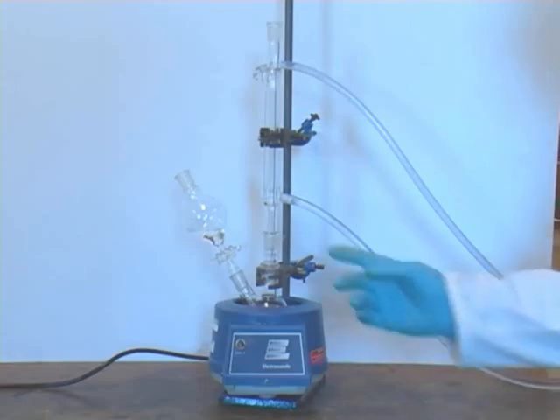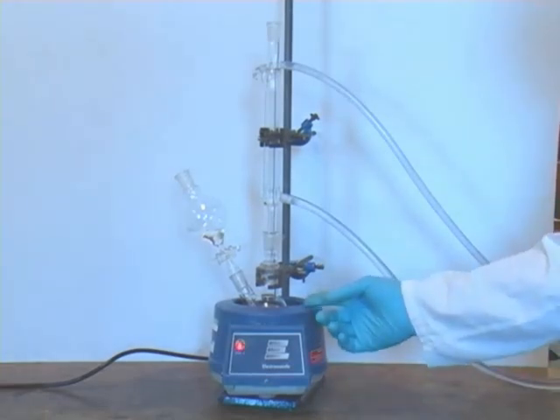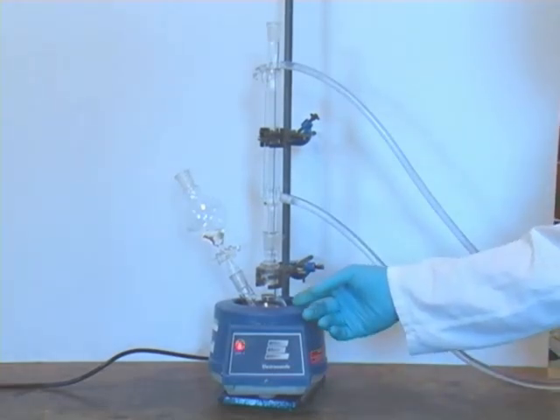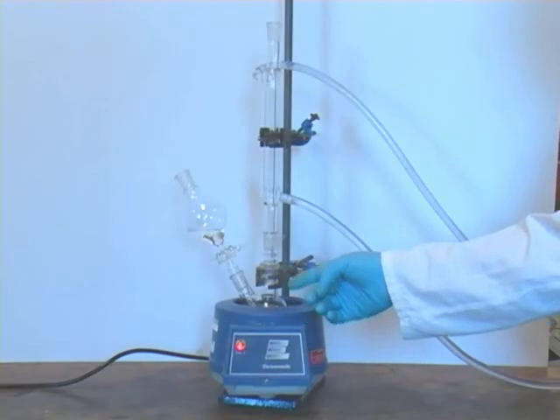Here we have a heating mantle at the bottom. Alternatives include heating with a Bunsen burner, a steam bath, or either an oil bath or a heating block on a hot plate.